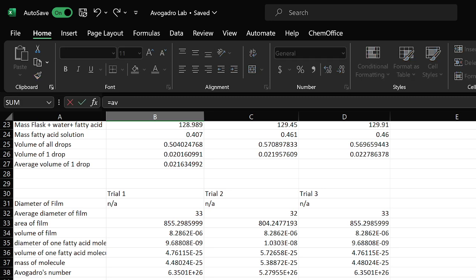Now we can take the average of that. Pretty easy. You just do this average thing again. Select these 3. No, don't do that. Actually, I believe you can do that, but I'd rather just do this. Okay. That'll give you the average. You can also do the standard deviation. Once again, your pick. I'll use this one. Very good. And percent error.